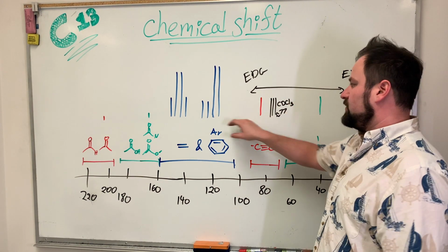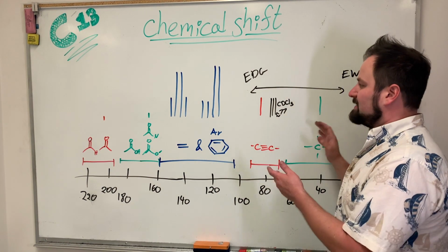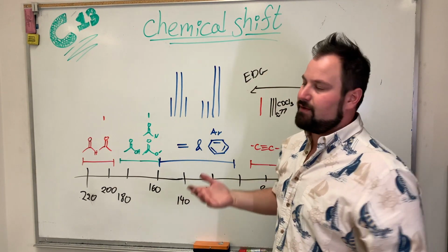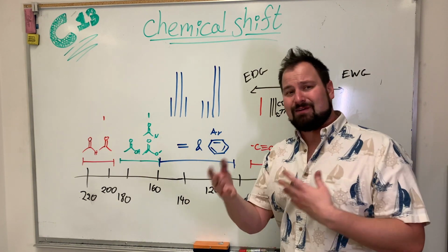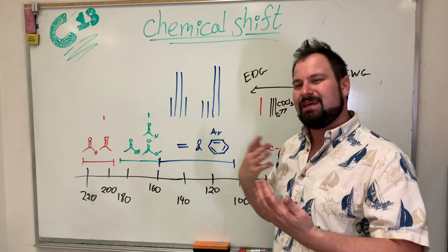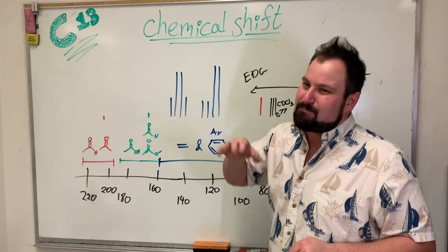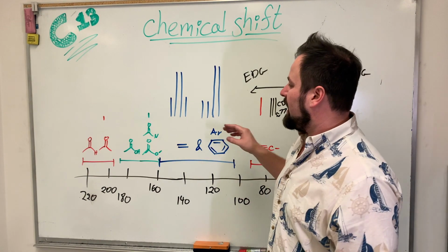But in general, you have these, and mostly they're all the same height, with the exception of if you have a symmetric something, they may in fact be twice as tall. If you have 2 of them, 3 times as tall. If you have 3 of them which are symmetric, this isn't a perfect thing. You're kind of waffling because sometimes it's going to be in the middle and you wonder, is this really symmetric or not? So that might indicate that, and you always put it as an asterisk. That might mean that there's a symmetric set here, or it might not.